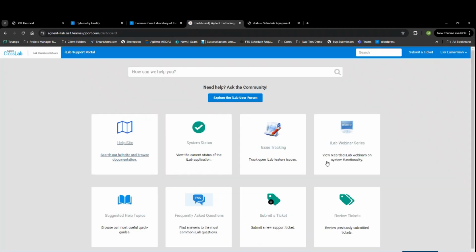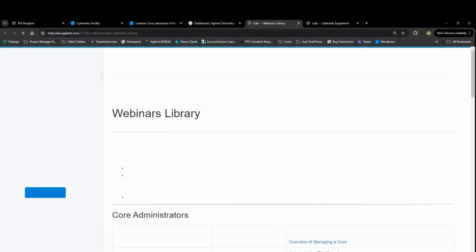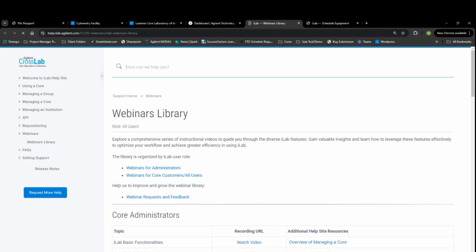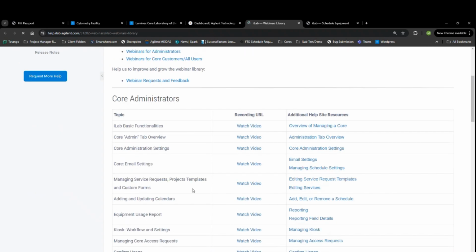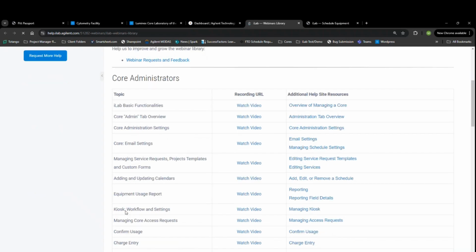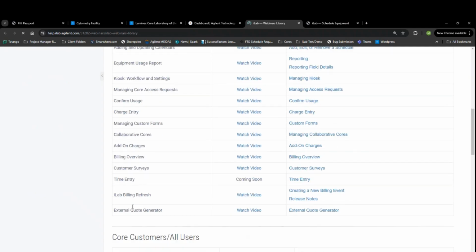Back to the help dashboard, you also have the ability to view some iLab webinars. There are quite a few over a number of topics that can be viewed. So we have, for example, the iLab basic functionalities, a few different options in there.